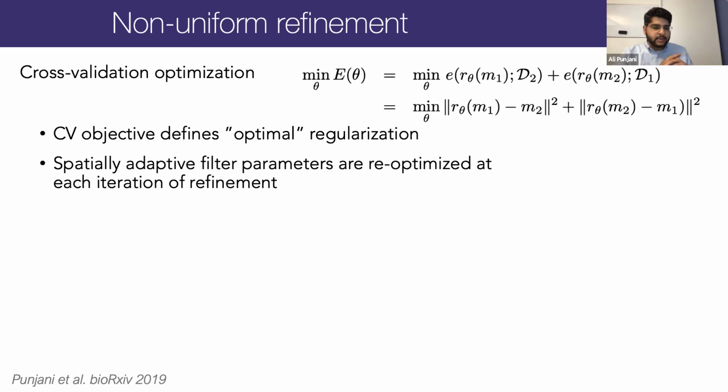instead of that, we decided to come up with a formal framework from which we could derive an optimal regularization that would give us the properties that we were looking for without any tuning or creation of masks or parameters to choose. And it turned out we were able to do that in a pretty nice formulation where we set up the problem as one where we have to optimize parameters of our regularization operator.